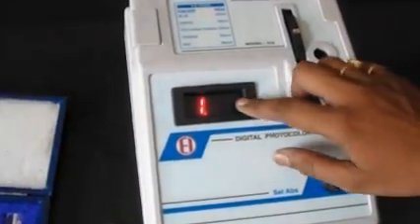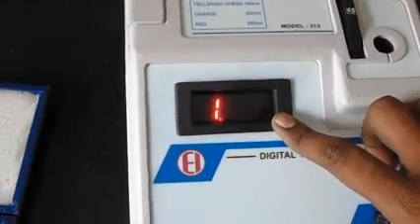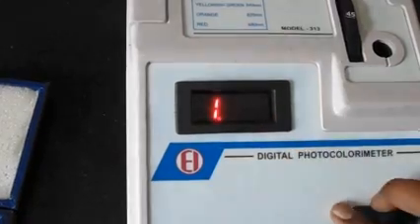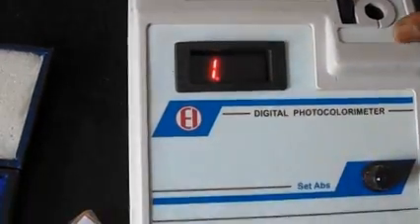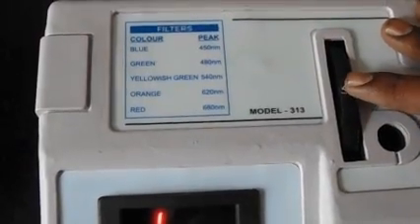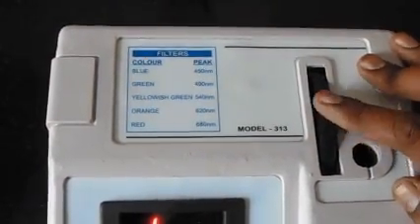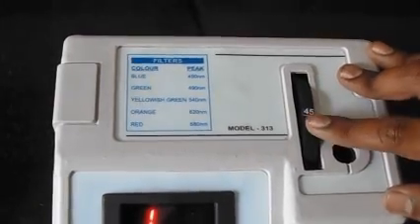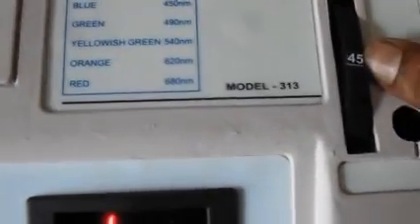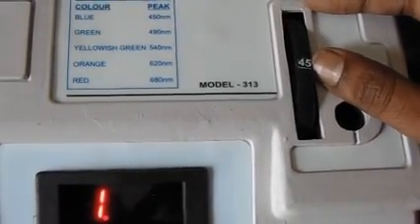The instrument has a 2.5-digit, 7-segment LED display for accurate and fast reading of optical density. It has 5 built-in glass filters which can be rotated by hand to select the required wavelength. The wavelength of each glass filter is written on the rotating disk — for example, '45' written means it is a 450nm wavelength filter.